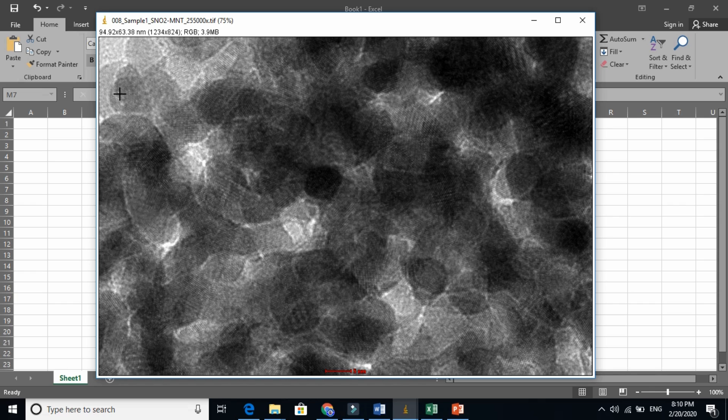So if you want to find the average size, just hold the shift and write like this.